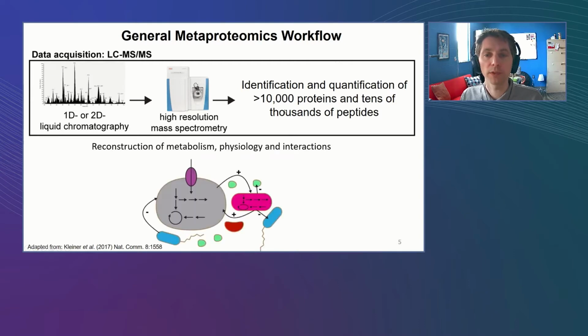Once you have this data, you can use it to start understanding what is going on in your community. So you can use it to reconstruct the metabolism, physiology, and interactions within your community.